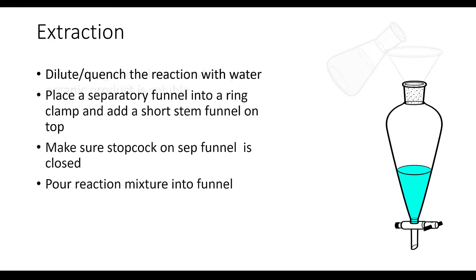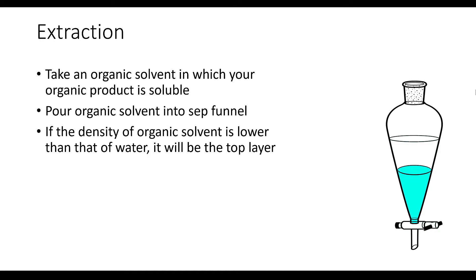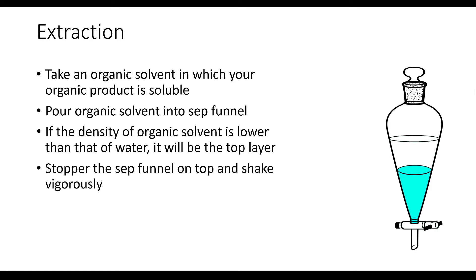Now it's time to add the organic solvent. Choose an organic solvent in which your product is the most soluble, and pour it into the separatory funnel. If the density of the organic solvent is less than that of water, it will remain on top of the water layer, and because the two liquids are not miscible they're going to sit as distinct layers. Then put a stopper on top of the funnel and shake it vigorously but carefully. In most cases this will result in an emulsion, so let it sit and settle so that the two layers reform.